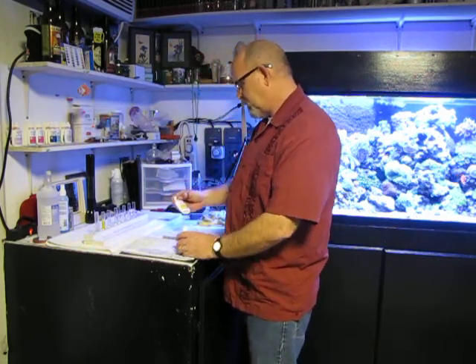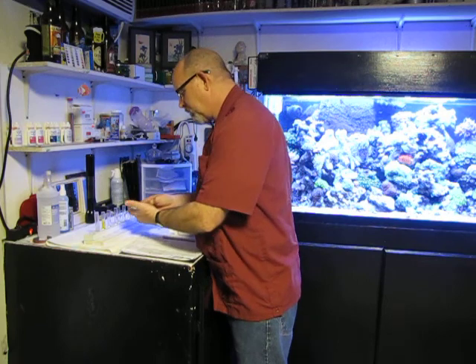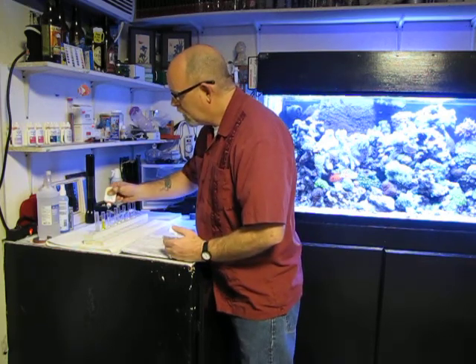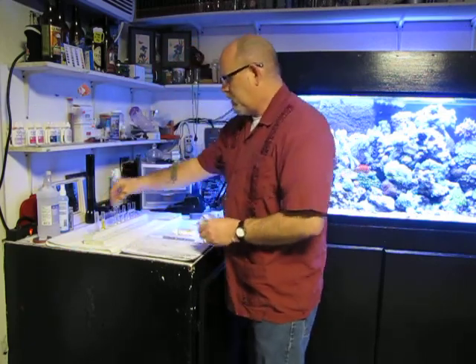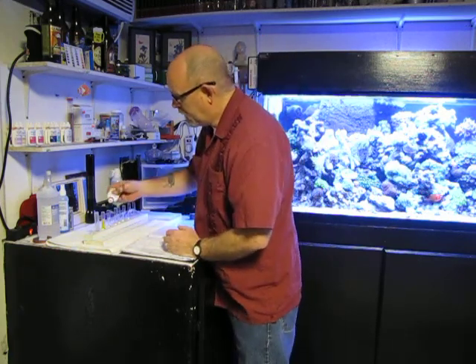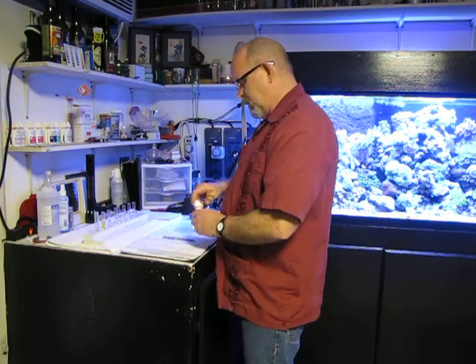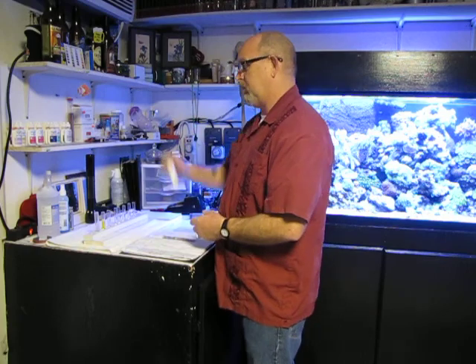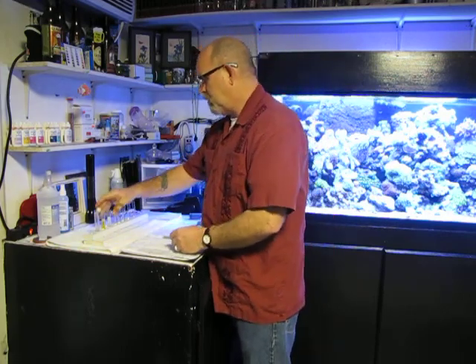I'm going to do ammonia next. Bottle number one always first — eight drops. Give it a little stir. And eight drops again for part two of ammonia. This part comes out real quick so you've got to be careful with that. Give it a little shake and put it back.